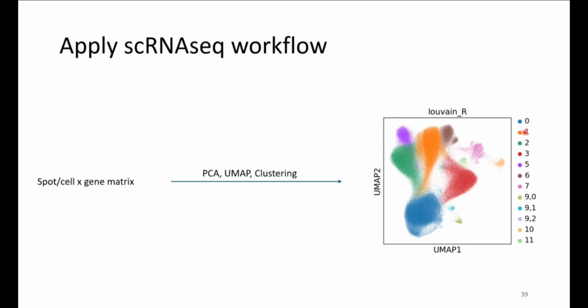And what I did here is I clustered them in some cell types. Now, if I would do the same thing on a single cell RNA sequencing dataset, the clusters that I see here would actually be super distinct because they are very different. There's immune cells and there's skin cells, for instance, in this dataset. And here, what I see is all these kind of mixture cell types.